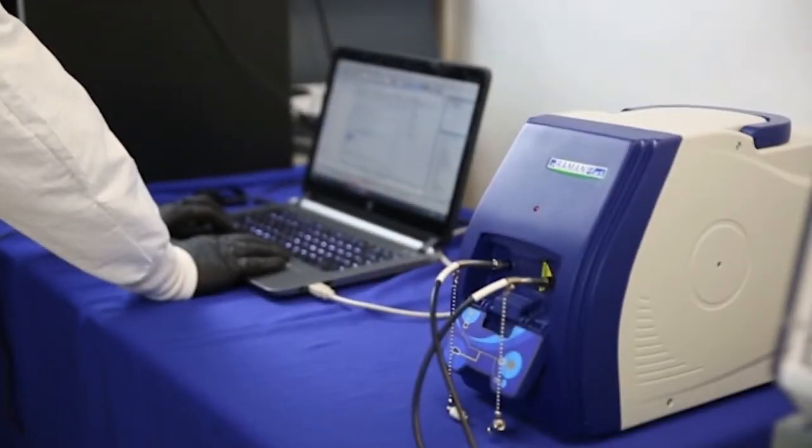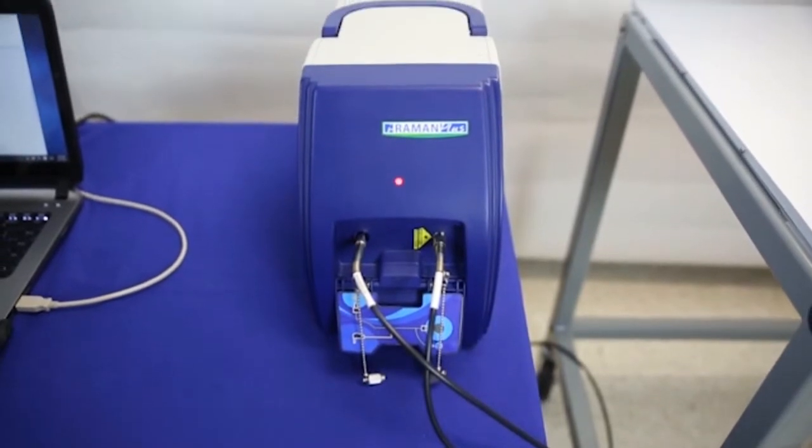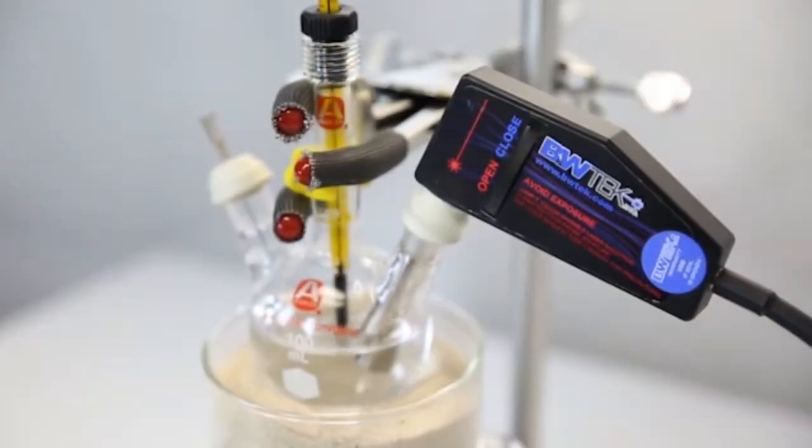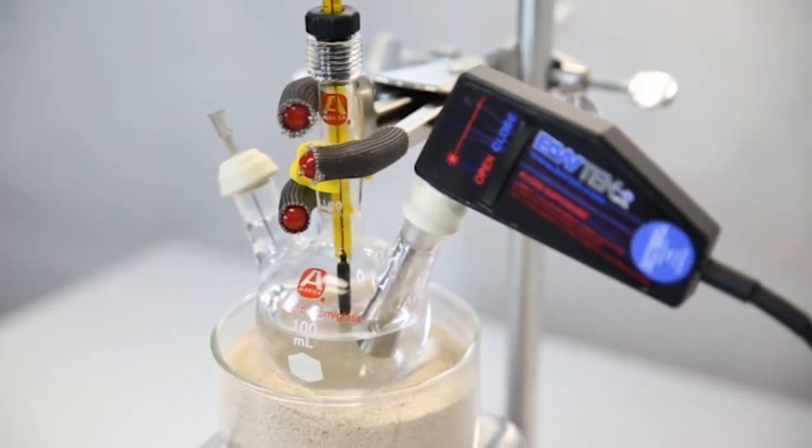For today's experiment, we will be using our i-Raman Plus portable Raman system with a 785 nanometer laser excitation to monitor the hydrolysis of acetic anhydride. The hydrolysis process converts acetic anhydride to acetic acid via nucleophilic carbonyl substitution.